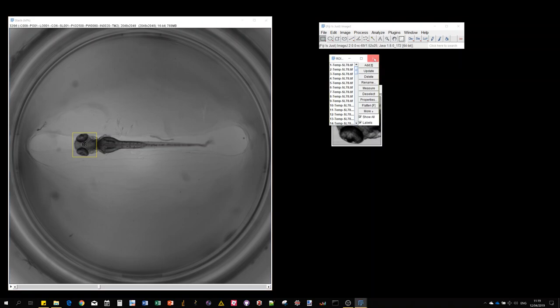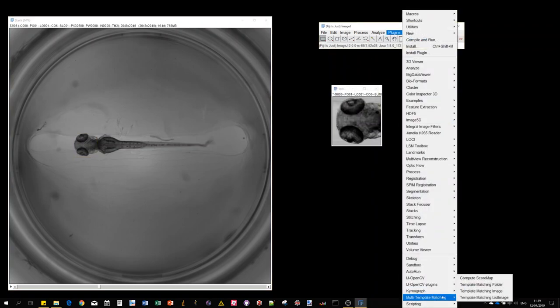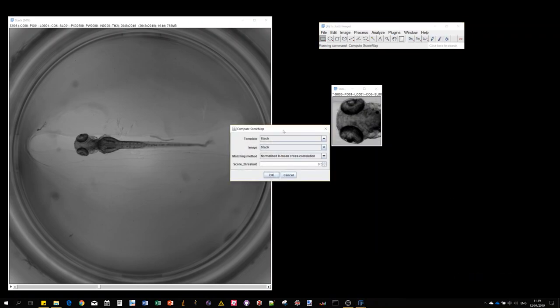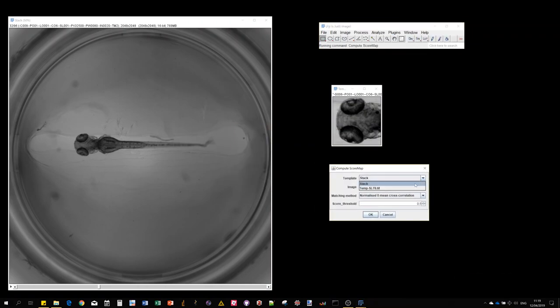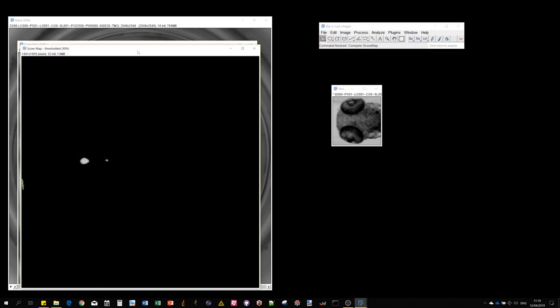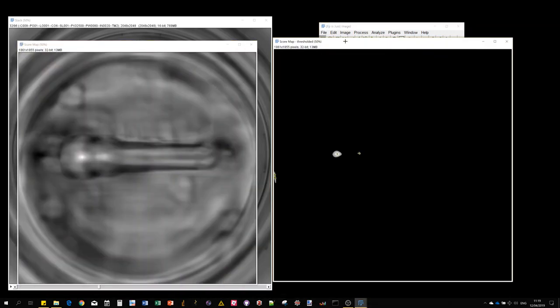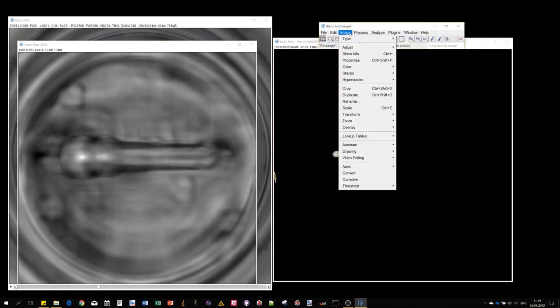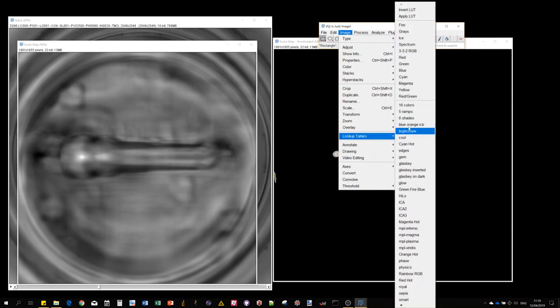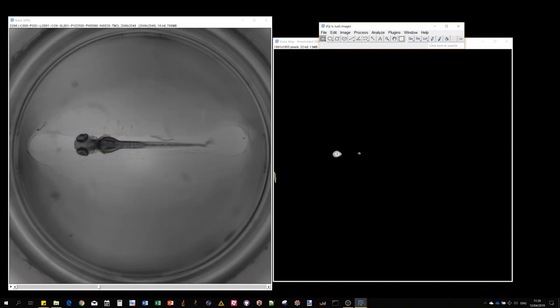A quick word about other plugins we're providing. You have one called compute score map, which gives you an idea of how template matching is working. You provide template, image, method, and a score threshold eventually for multiple maxima detection. You get the correlation map - I can put a nice lookup table. You can see nicely that the highest prediction was here. The thresholding and maxima detection is only used when we do multiple object detection.